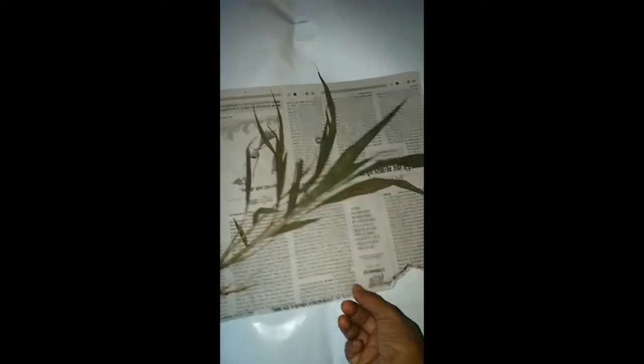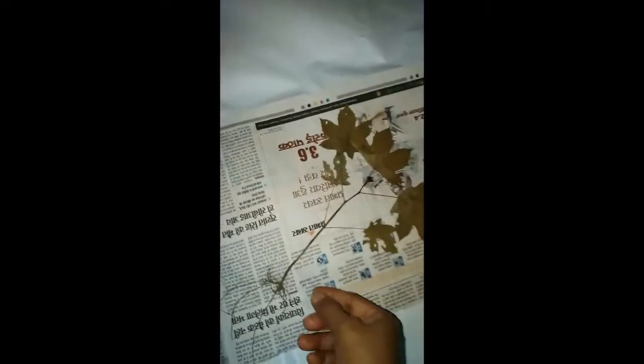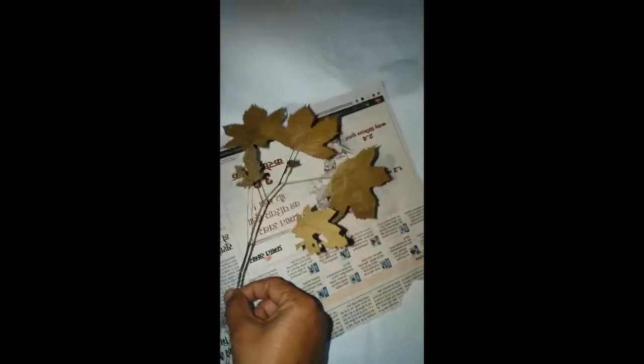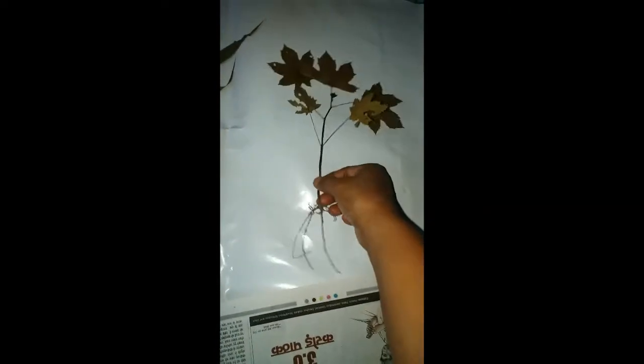In the same way we will open and take out the other plants. Here you can see this is the grass — all its parts are properly dried. This is the castor plant, Ricinus communis — you can see how well the leaves have dried. We will keep this plant also carefully.